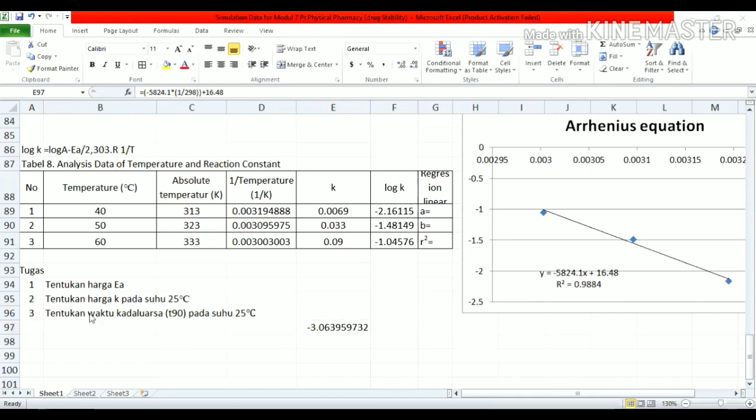For example, in this experiment, for the first, you have to weigh 0.1 gram and then dissolve it in 500 milliliters. So that's the initial concentration of the drug. So use that initial concentration, not the initial concentration of the same condition as the sample. Okay, I think that's how we can analyze the data simulation for this experiment. I think it can be understood.